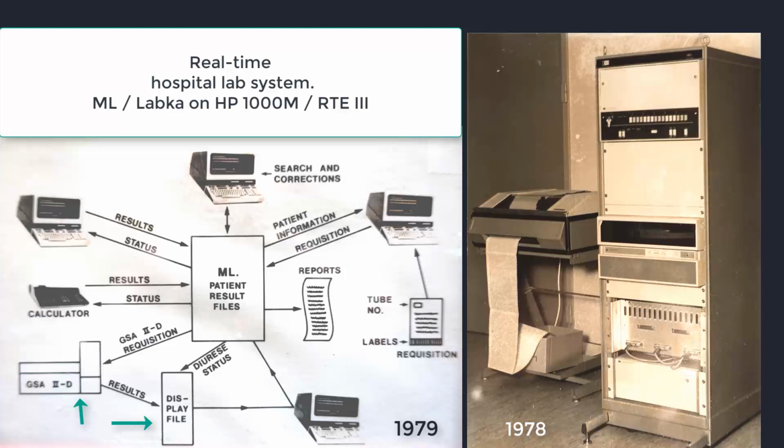When acquiring the lab computer in '78, emphasis was placed on the instrument real-time problems, because laboratory instrument online connection was not so common in the '70s. If an instrument had a serial 232C output, it was lucky.